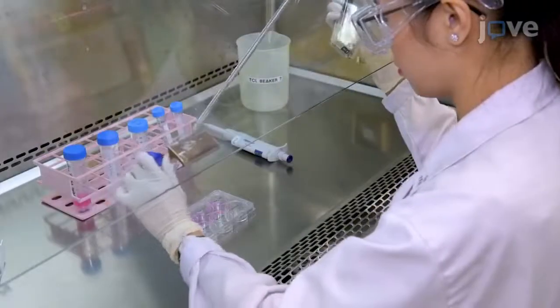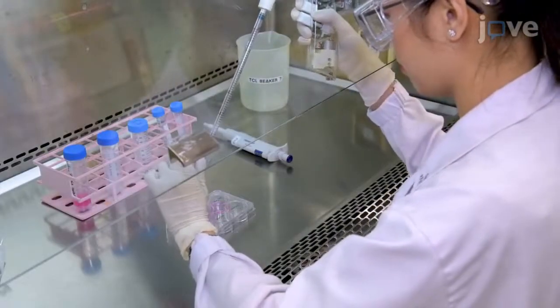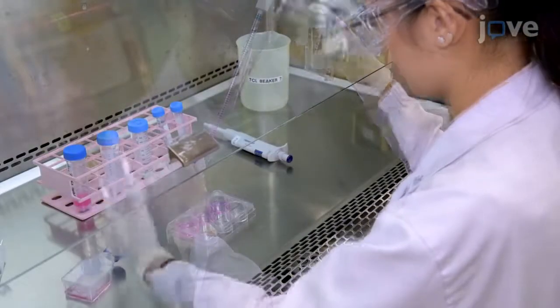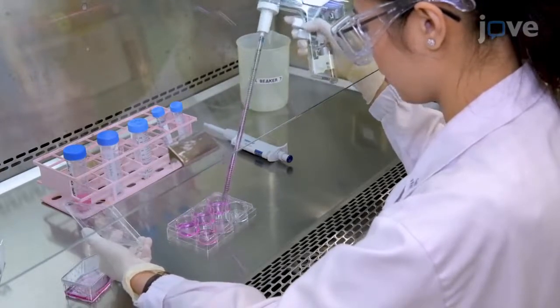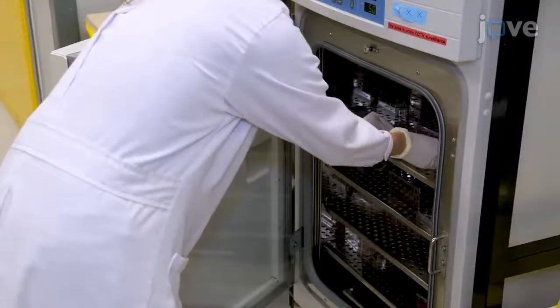Then, in a biosafety cabinet, seed MRC5 human lung fibroblasts onto 3 6-well culture plates at the concentration of 1 × 10⁵ cells per well. Incubate the cells at 37 degrees Celsius.